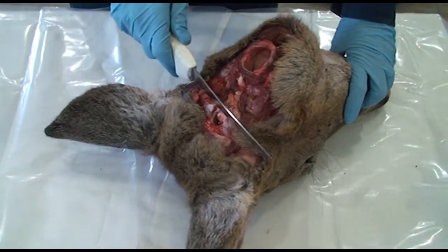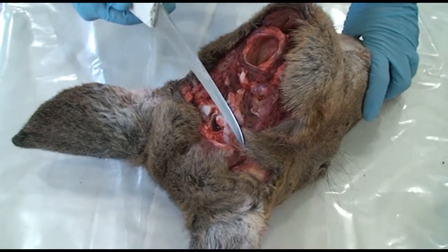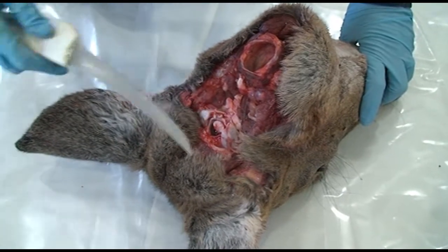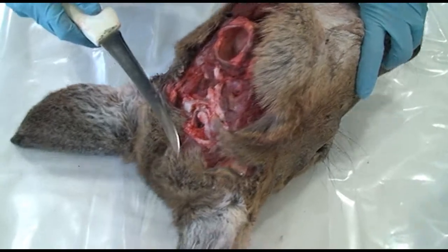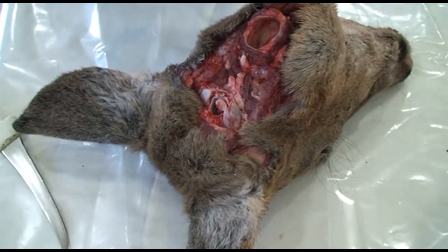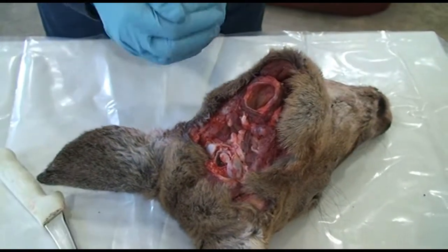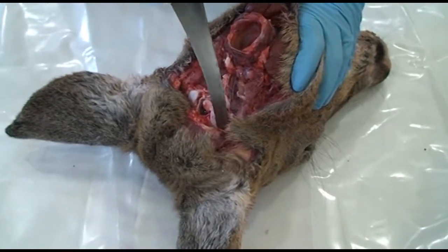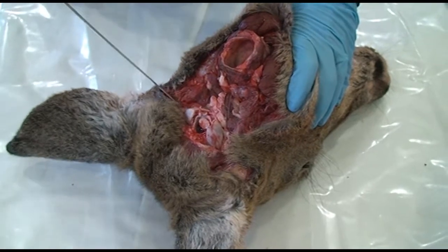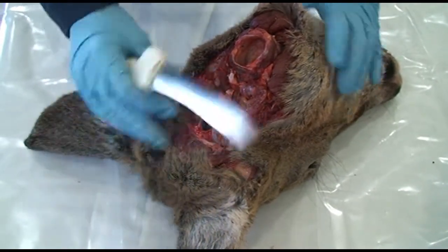When you get down to that, you're going to have some tissue covering those, but you'll feel them with your knife. Then slide your knife underneath that and cut the tissue until you see the opening, the foramen magnum that houses the spinal cord. Once you can see that, and you can keep checking to make sure you're in the right joint, the joint kind of encapsulates the other side like this, and you've got lateral collateral ligaments that hold that joint in place. You want to take your knife down and cut those. Once you cut those lateral collateral ligaments, it'll open up that joint space even more, and you can press down a little bit on the head and open that joint up.